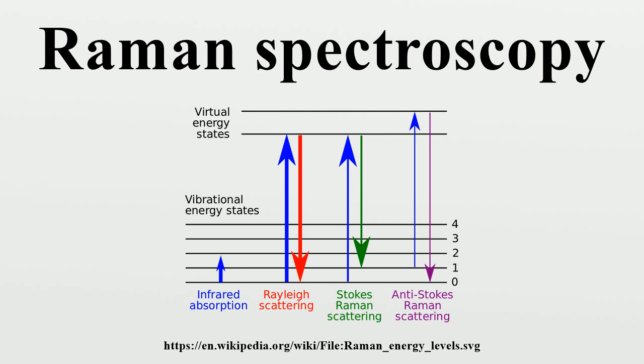Raman, who observed the effect by means of sunlight. Raman won the Nobel Prize in Physics in 1930 for this discovery, accomplished using sunlight, a narrow-band photographic filter to create monochromatic light, and a crossed filter to block this monochromatic light. He found that a small amount of light had changed frequency and passed through the crossed filter.